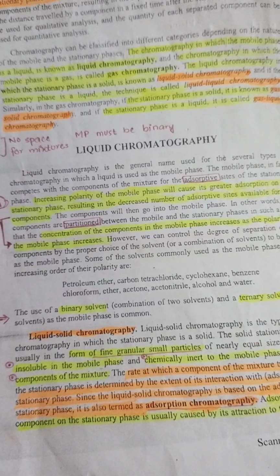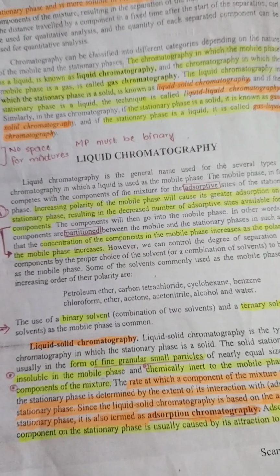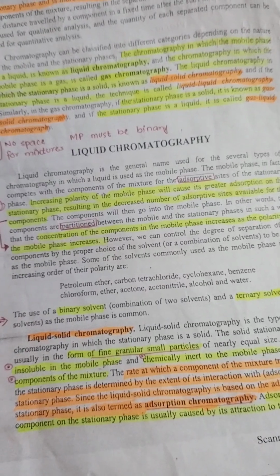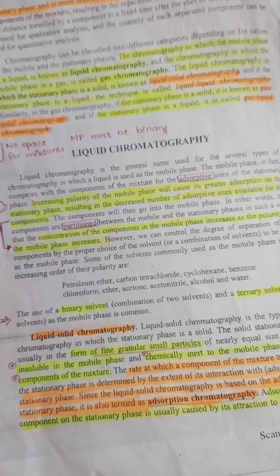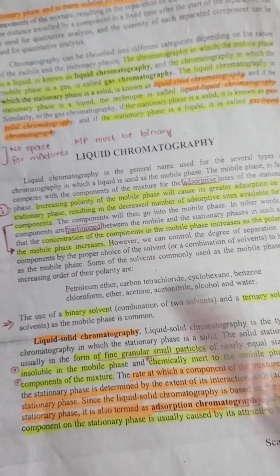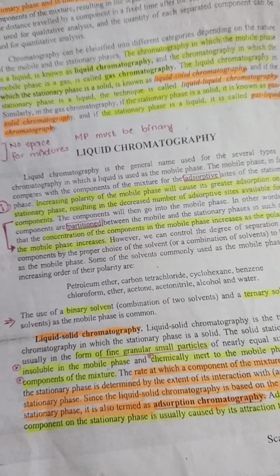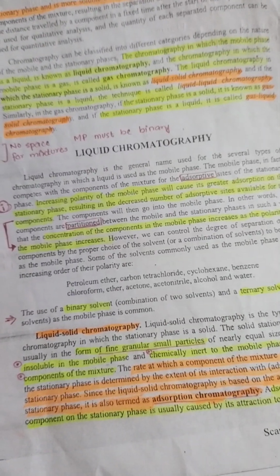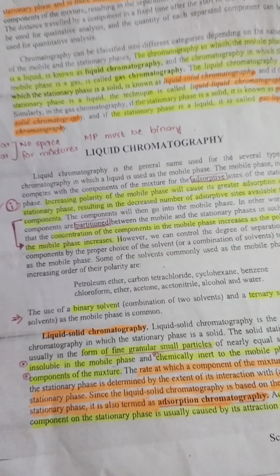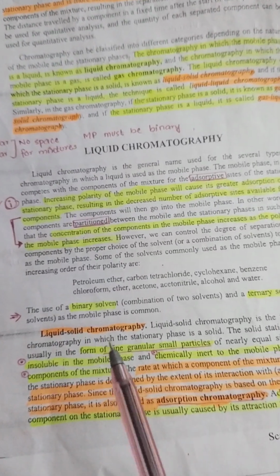If our mobile phase is polar, it sweeps over and is adsorbed on the stationary phase, because our stationary phase is also polar. We repeat it again. If the mobile phase is polar and the stationary phase is also polar, the mobile phase is adsorbed on the stationary phase, and no space is left for the adsorption of the component on the stationary phase. That's why we use a binary solvent.